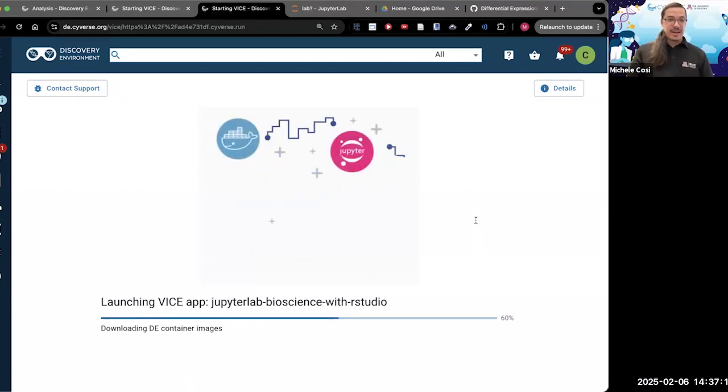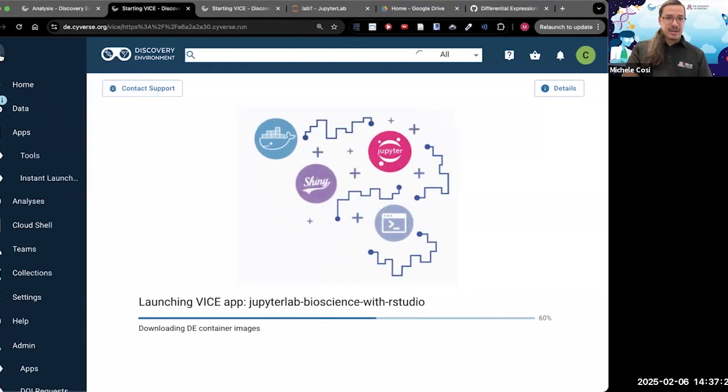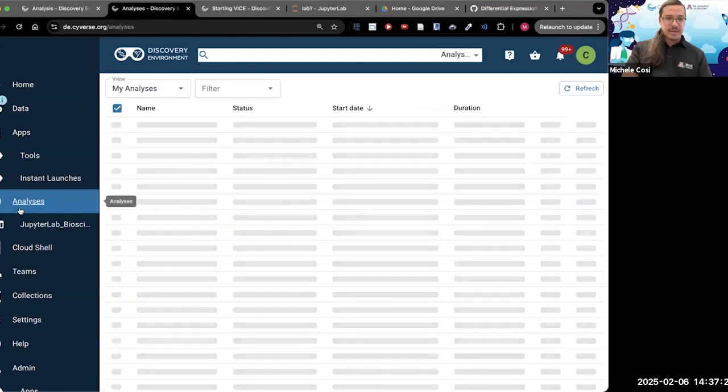And whilst you are typing, it seems like things are not starting. So what I'm going to do is fall back on an analysis that I had running.